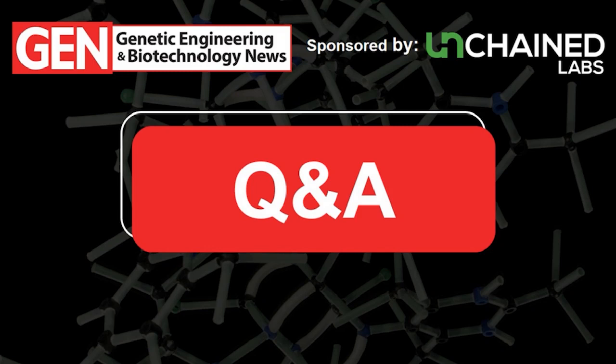No, I like the concept of doing in process, because what you're trying to do is really characterize your process, right? And you want to be able to get data on that quickly. So similar to a PCR, where you do an extraction and then you get your PCR titer, you could do a sample cleanup like Kevin is saying, and then get your Stunner number. And what's nice about this is that, whether it's exactly the right number for empty full, it's more of a handle on understanding your process, that you're getting a consistent number with this method through your process.